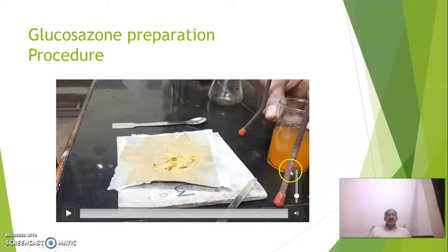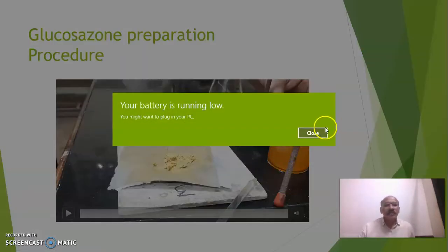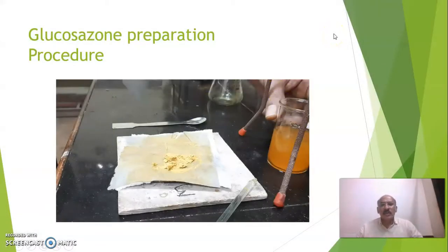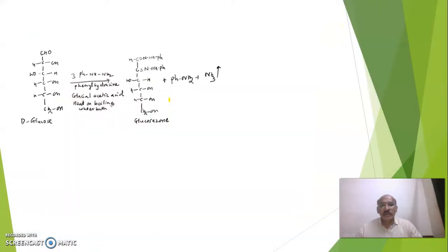That is called a mother liquor. And then we have to go for again filtration by using filter paper, and the product will be separated which we have to dry, weigh, and then proceed for the calculations and melting point determination.